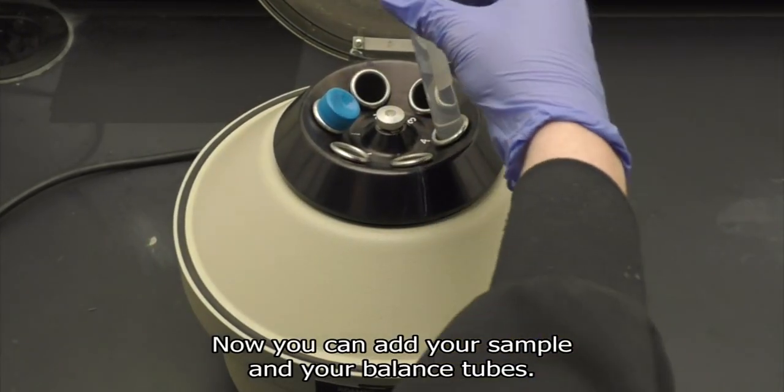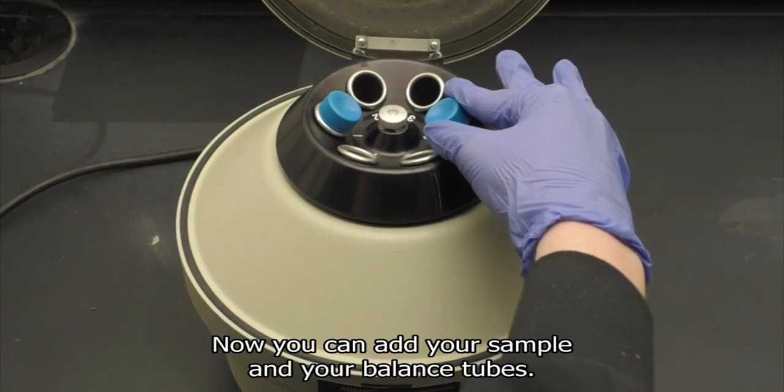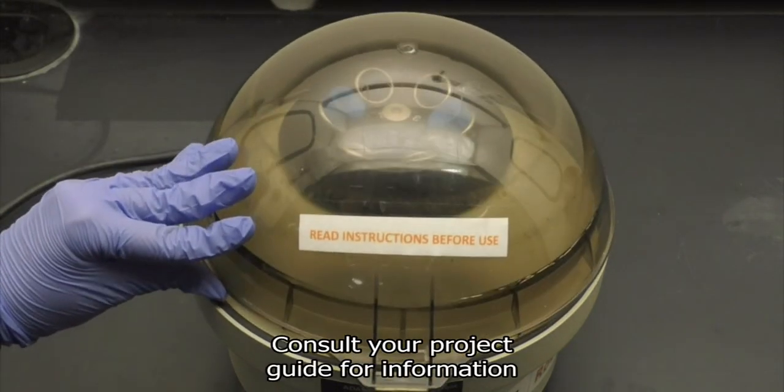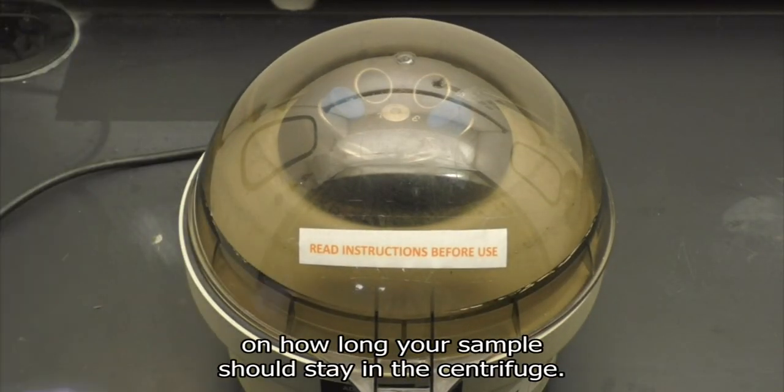Now you can add your sample and your balance tubes to the rotor. Shut the safety cover and move the toggle switch into the on position. Consult your project guide for more information on how long your sample should stay in the centrifuge.